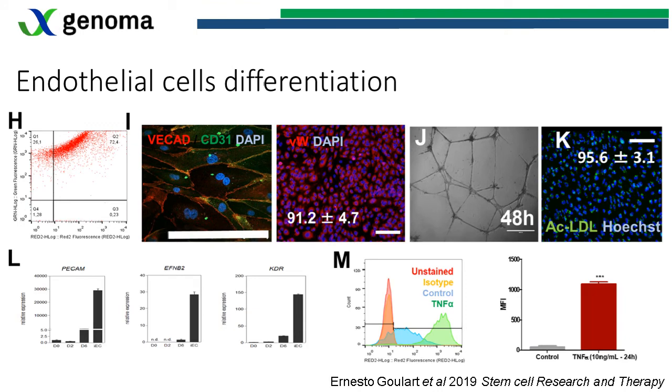And for looking at what type of endothelial cells we generate, we need to check the expression of arterial or venous markers. And we observed that CD31 expression is broadly expressed in our cellular population, as we show in the flow cytometry chart, but we also see the expression of important arterial markers such as ephrin B2.